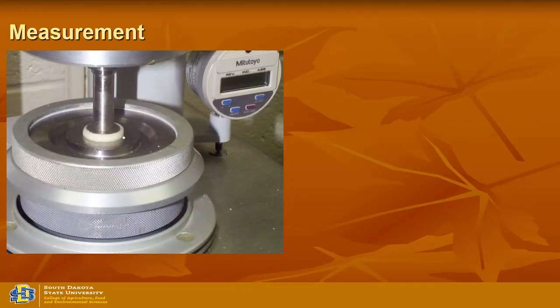This is a close-up view of what you apply, what kind of test you do. So in the measurement, you have the bottom plate, and that can be heated and cooled, and then the sample is placed in between the disc and the bottom plate, and the disc is where you apply the sinusoidal wave.